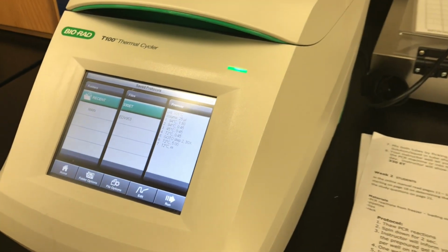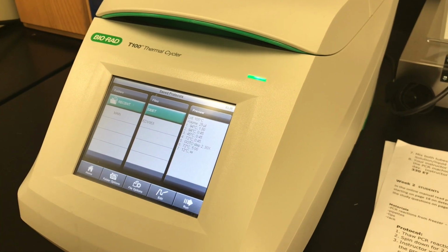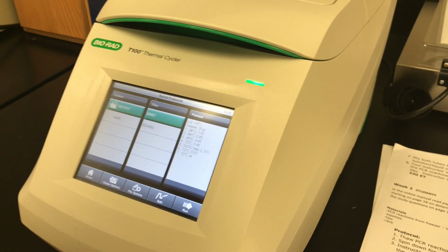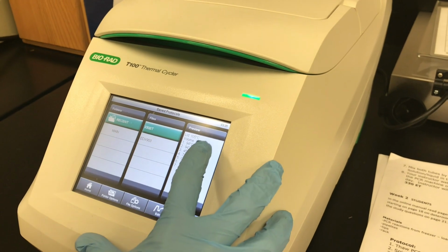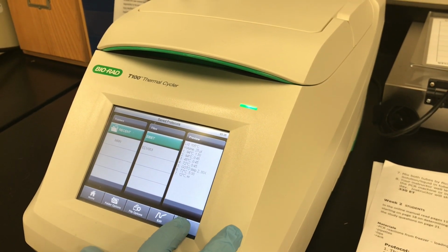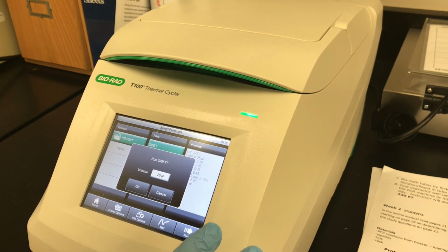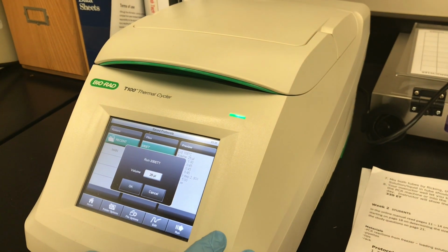And it's pretty nifty. Program's already in there. Looks like we got a preview. And I think we just want to press run.